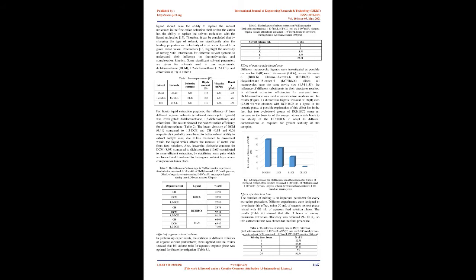The pH value of the standards, as well as the real samples, was adjusted to 3 with formic acid buffer solution. Macrocyclic ligands dissolved in organic solvent, 1×10⁻³ mol/L, served to entrap the analyte in a hydrophobic medium.